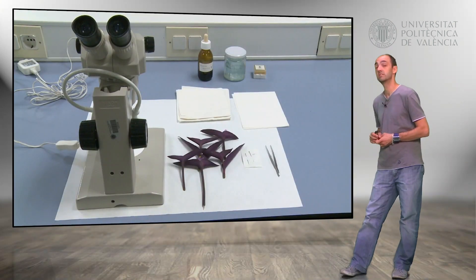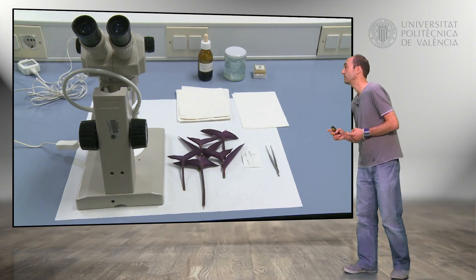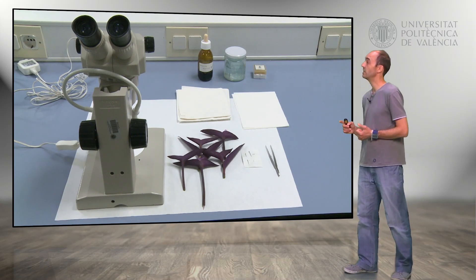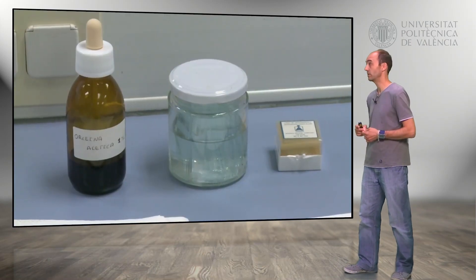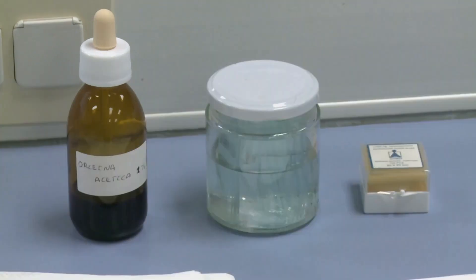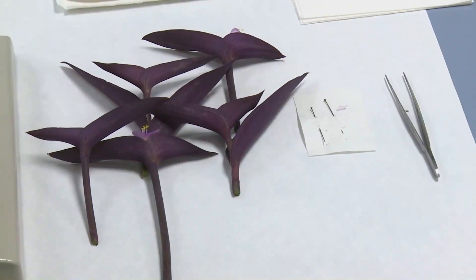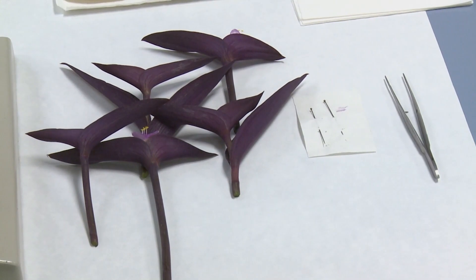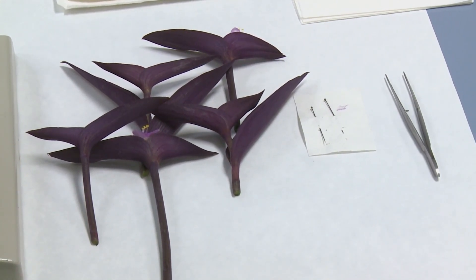Here we see the material. We have the flowers, the lens, the orcein, and the petri dish. We have the slides and the covers that we are going to use to stain and to mount the anthers. Here we have flowers in different stages, the needles, and the forceps.